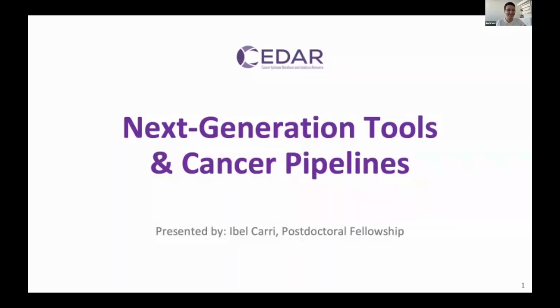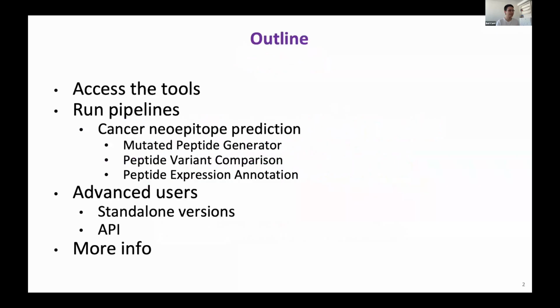Thanks very much, Ibel. Thank you, Nina, for the presentation. Can you see my slides? Yes. Thank you. So I'm going to present the next generation tools and how to run cancer pipelines using the NextGen site. And this is part of our extensive analysis resource that we provide in CEDAR.